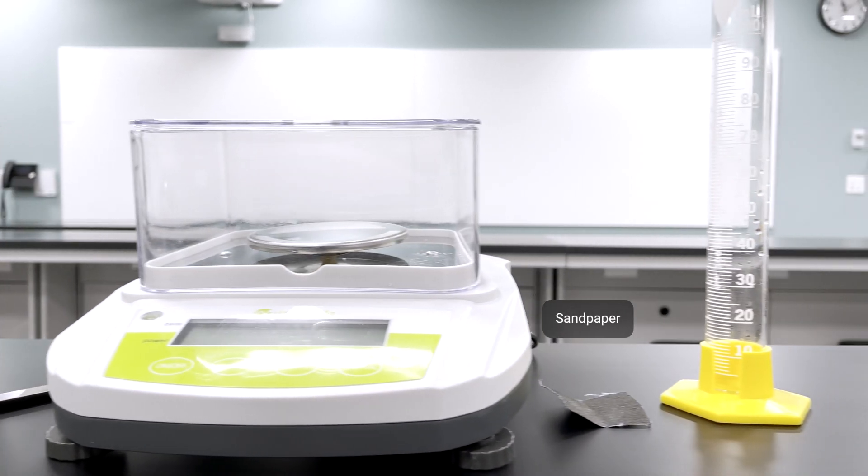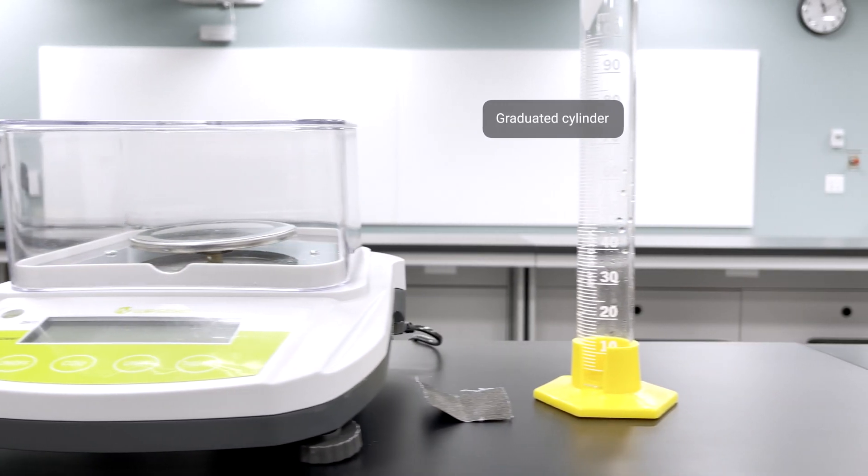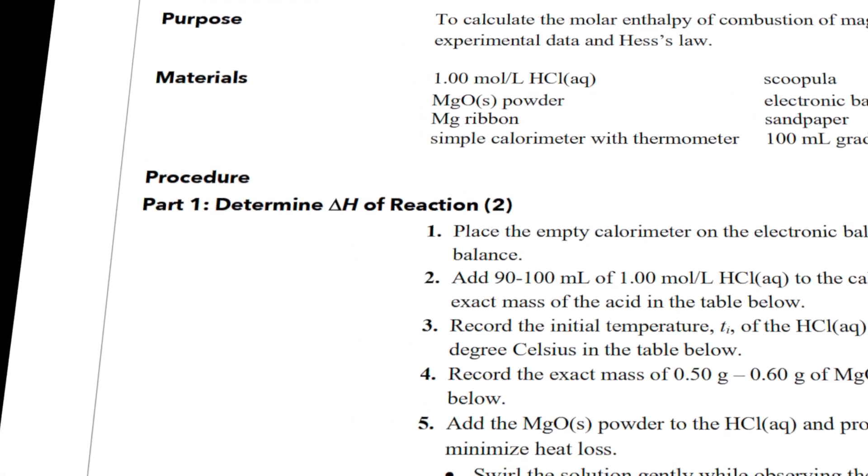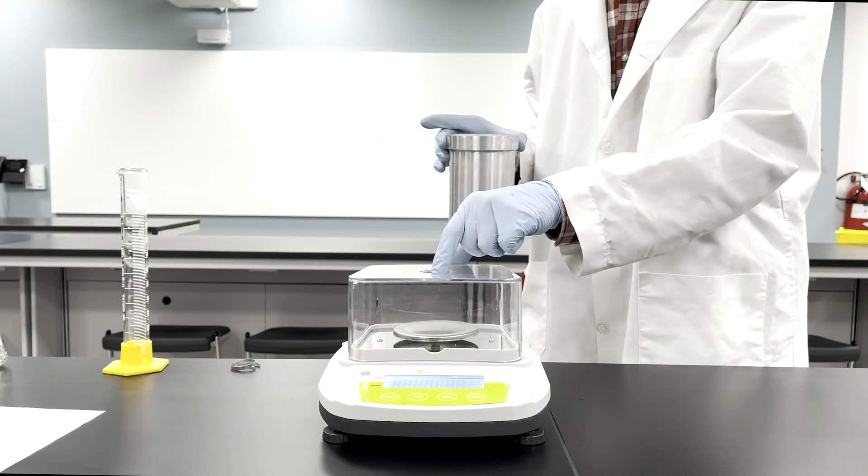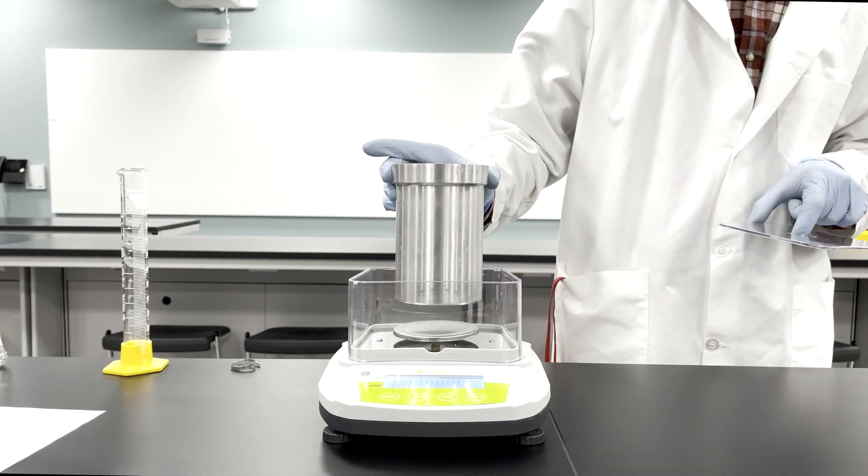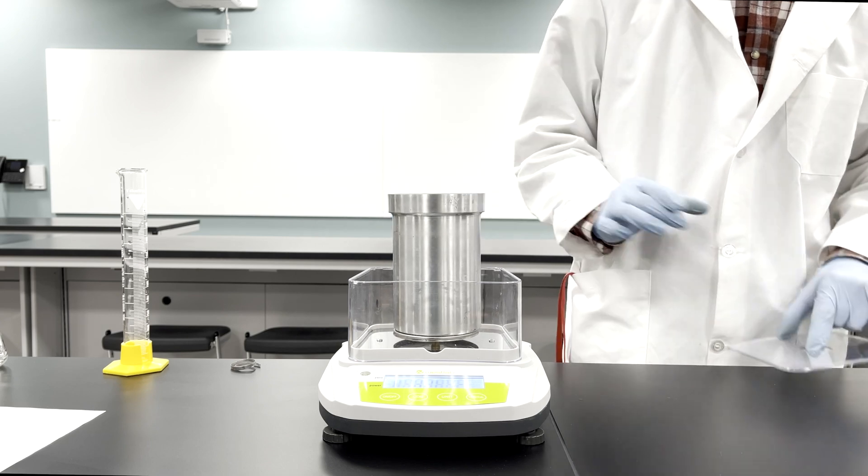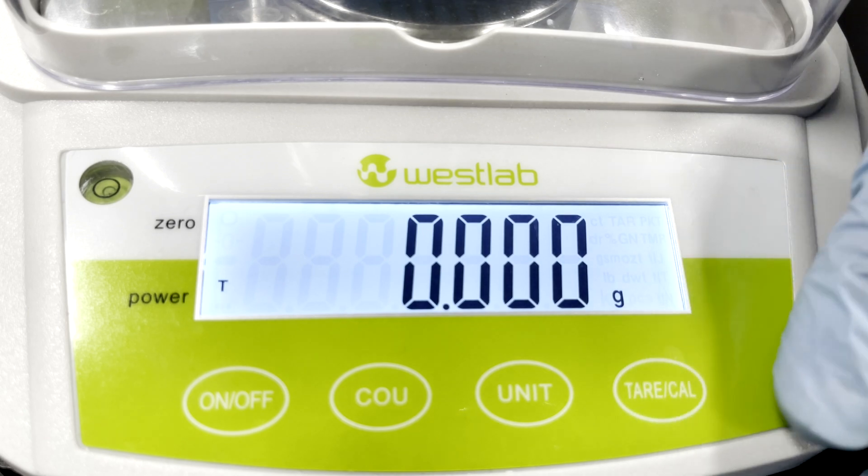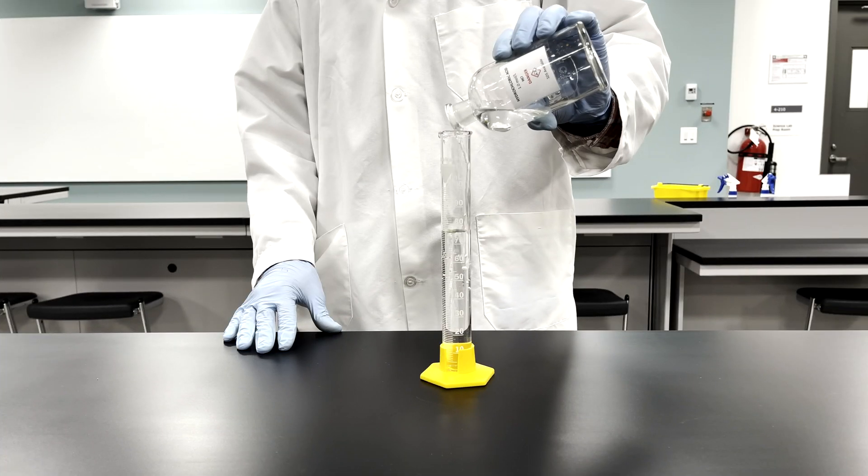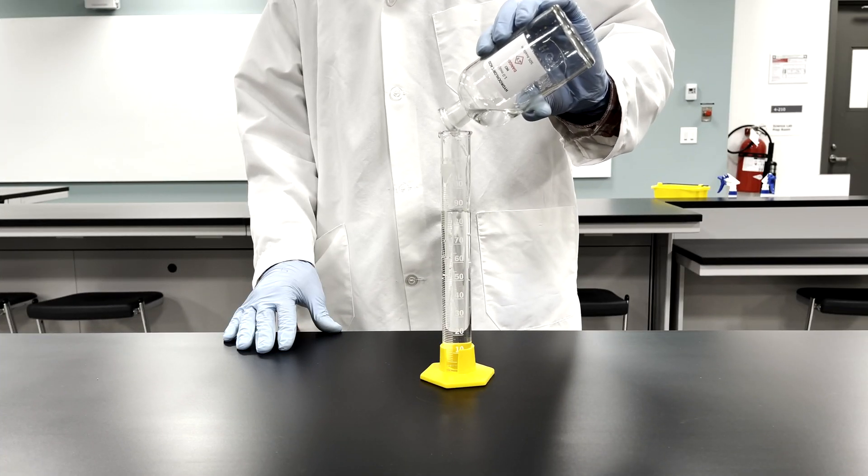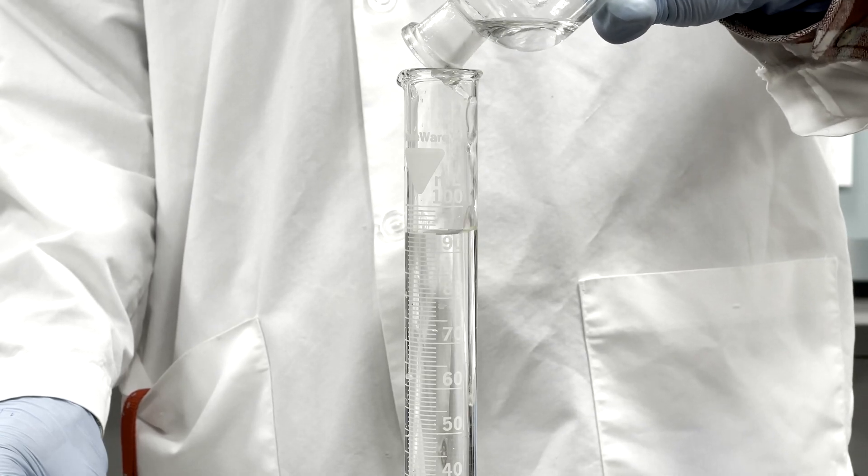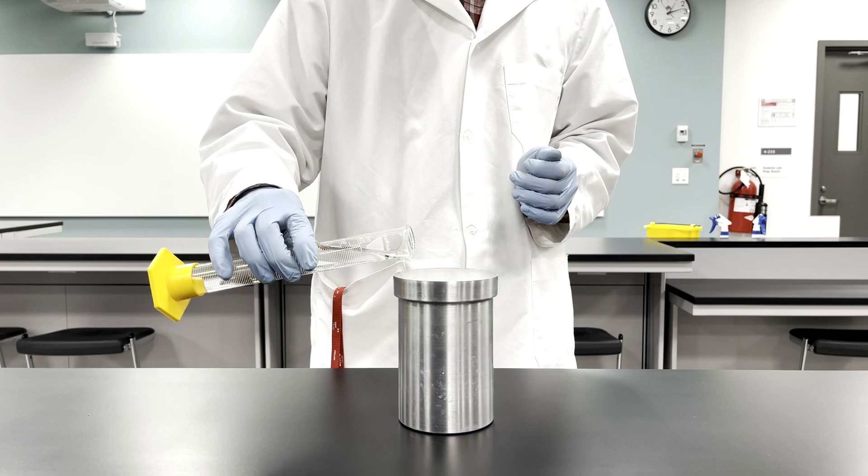In Part 1 of this lab, we shall determine the enthalpy change for reaction 2. First, place the empty calorimeter on the electronic balance and zero the balance. Around 90 to 100 milliliters of aqueous hydrogen chloride is poured into the graduated cylinder and then added to the calorimeter.